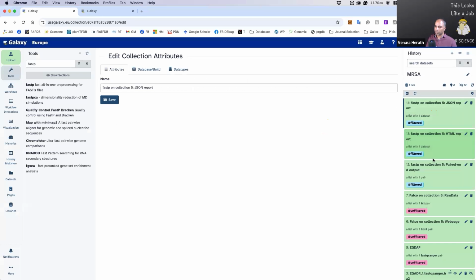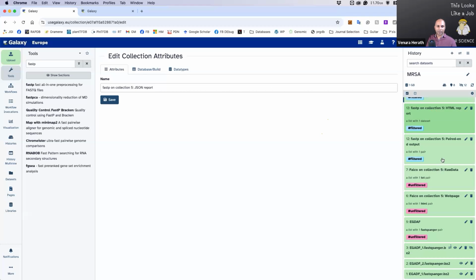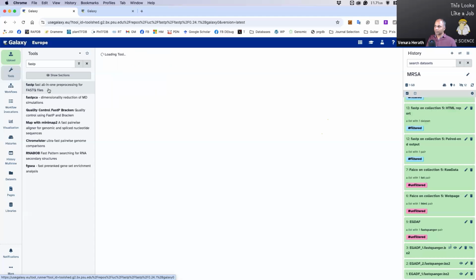Okay. So once you have the Falco output, not Falcon, Falco output, what you do is you basically click on the fastp.